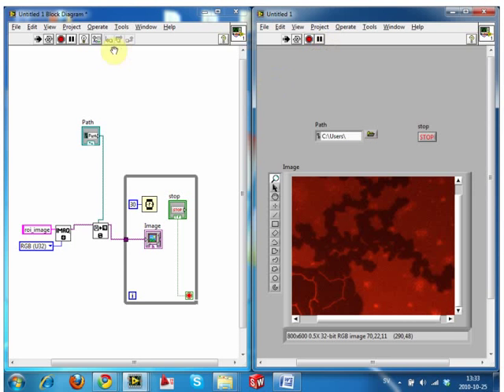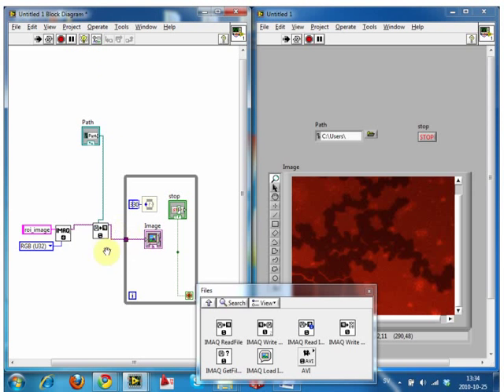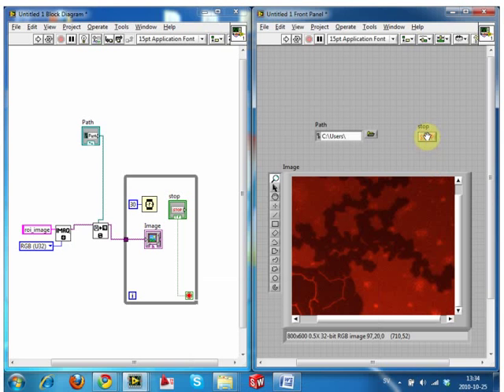But like I was showing in the first example, if we click on this little light bulb, it'll slow it down and show us exactly what's happening at this point in time. It shows us that this is reading a false signal each time. We've got data running along this wire showing the image all the time, and we've got this little timer running. Just one single image. It's the same file. As soon as we run this to here, it pulls the same thing in from this while loop each and every time. So all it's doing right now is reading the memory, 30 frames per second. Nothing else. If we hit the stop button, the VI stops. This little crosshatch pattern comes back.